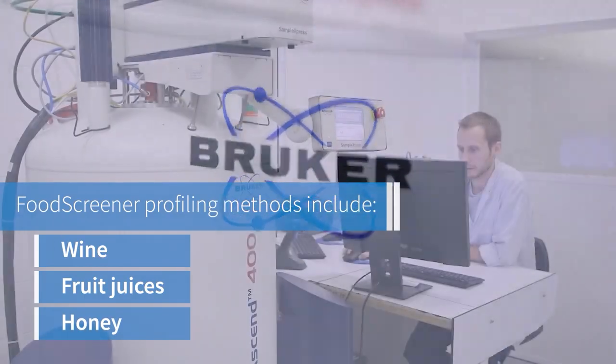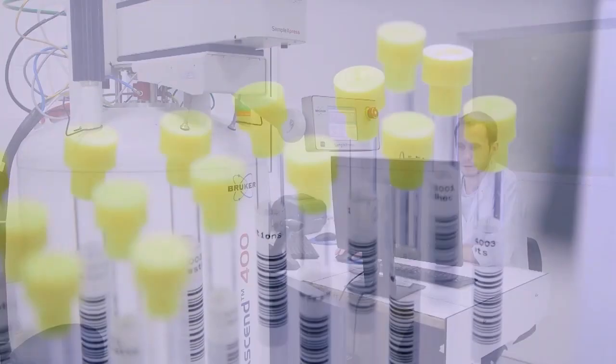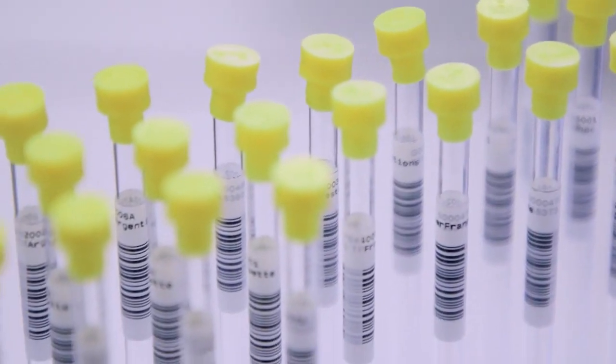Its unique targeted and non-targeted analysis allows the determination of purity, compliance of origin, composition, and freshness.